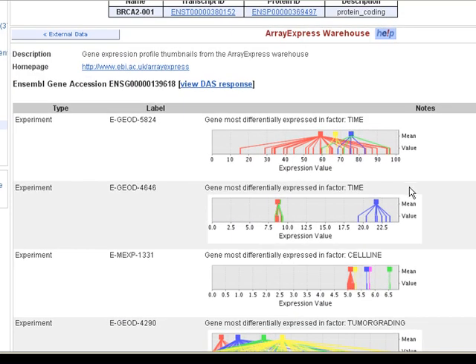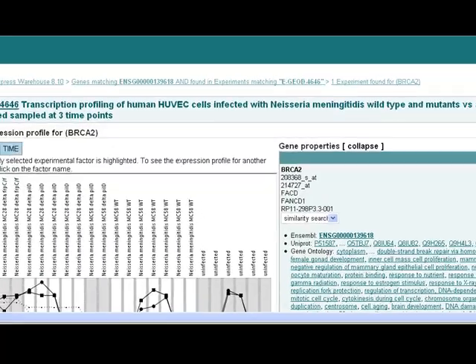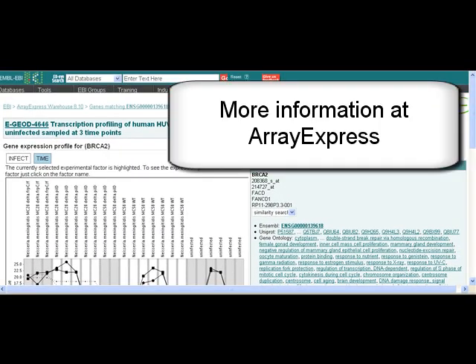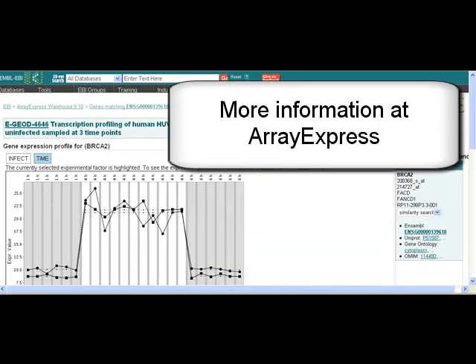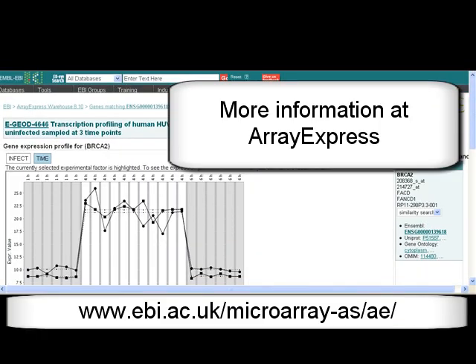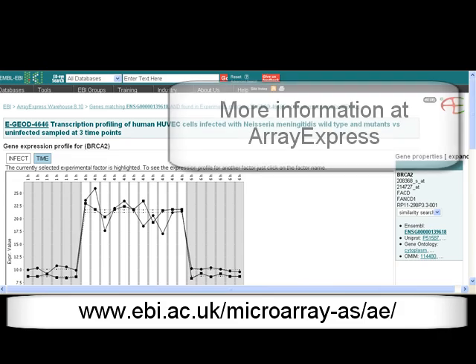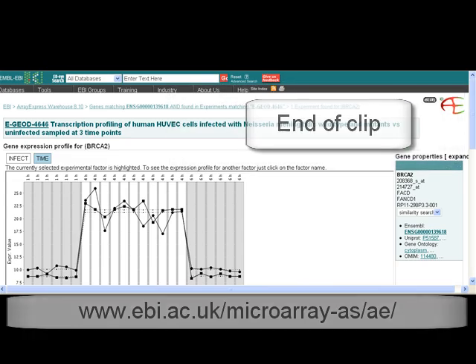To go to one of these experiments, just click on the graph. We jump to ArrayExpress, which is an EBI group. It is free!